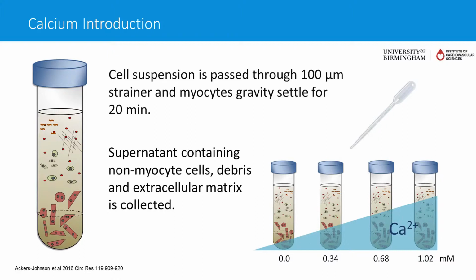Ronglih, would you have anything to add by any chance? I completely agree. And if people want more purity, then you can make the sedimentation time shorter. This way you will prevent those smaller, lightweight particles from coming down. You will get lower yield, but you get higher purity. That's one way to try to get purity. These are small differences, but it may matter in some experiments, but the compromise is the yield.